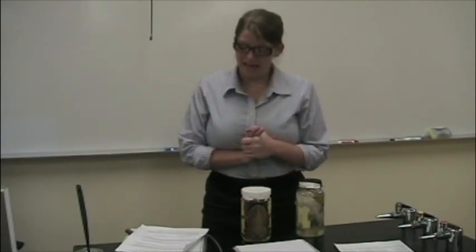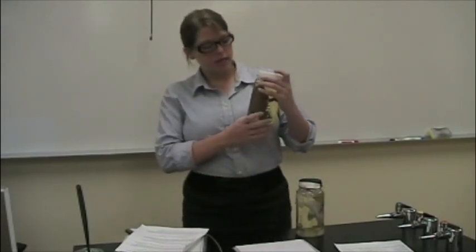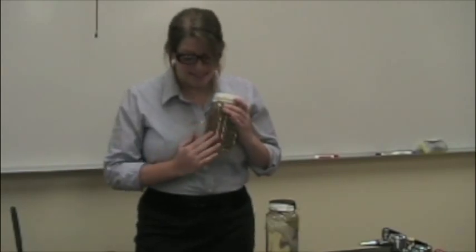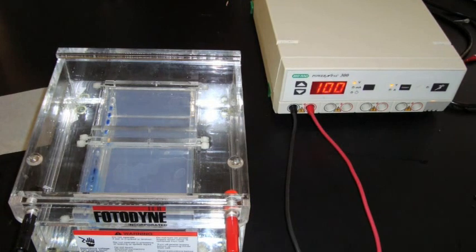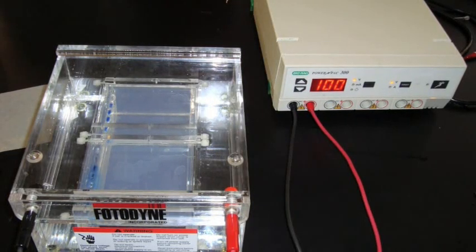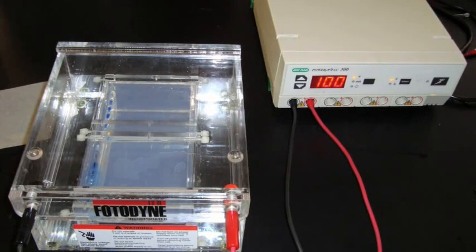This technique is used in CSI labs to match DNA of a suspect with a sample from a crime scene. To begin the electrophoresis process, pour your buffer into the box so a thin layer covers the gel. After you pipette the samples of DNA into the wells, put the lid on. Plug the black cord into the black outlet and the red cord into the red outlet. Turn on the electrophoresis and adjust the voltage — in this video we want 100 volts. Set the time to 30 minutes. After you finish, stain your gel, and in 24 hours your results should show how the DNA has moved in the wells.